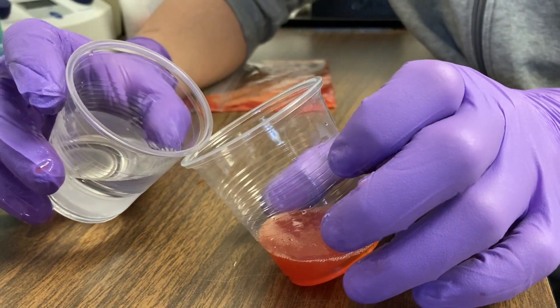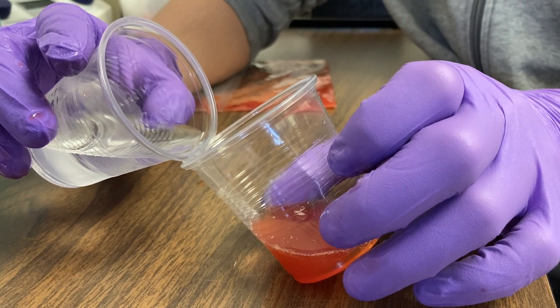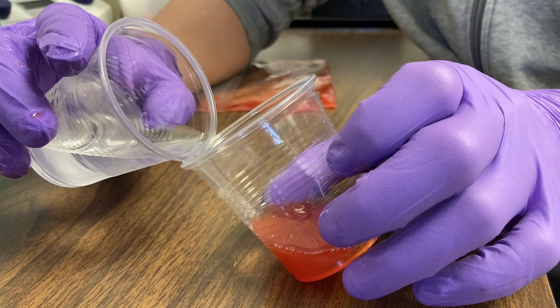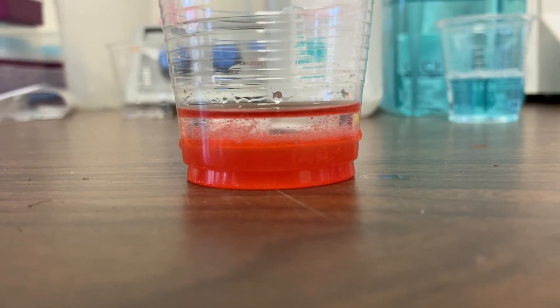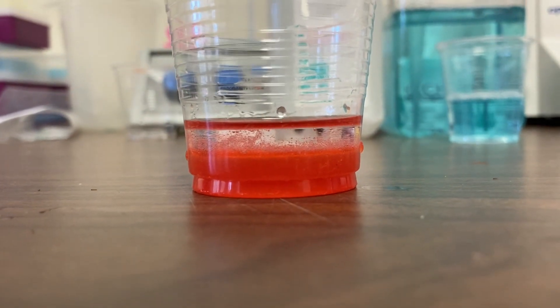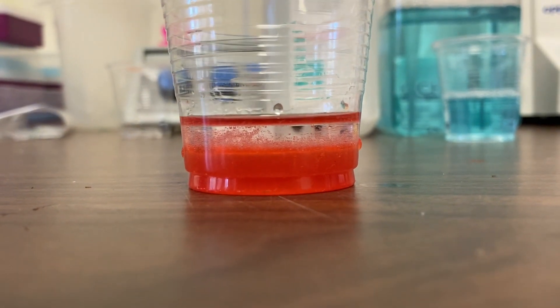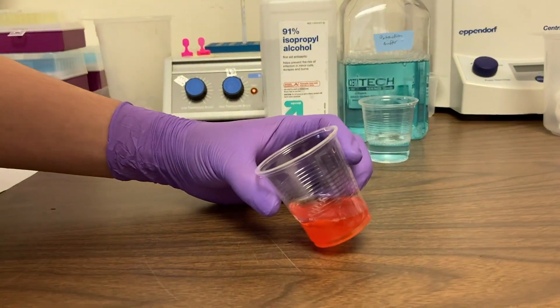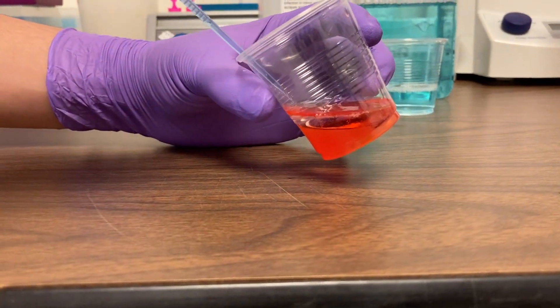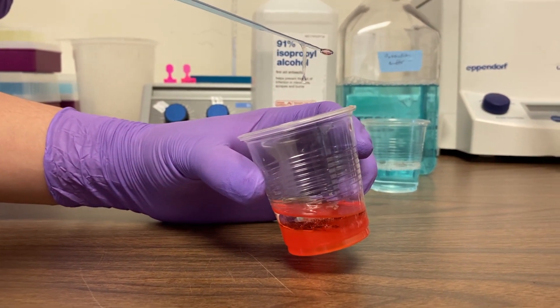We now add some ice-cold isopropanol, which is a type of alcohol, very slowly down the side of our cup, on top of our strawberry filtrate. What you should notice are some distinct layers. You may know that you can get sugar to dissolve into water, but not everything dissolves into water. If you've ever tried to mix oil into water, you know it does not work. Well, DNA does not dissolve well in isopropanol, so when we add that to the filtrate, the DNA comes out of the solution. And there you have it — quite a bit of strawberry DNA.